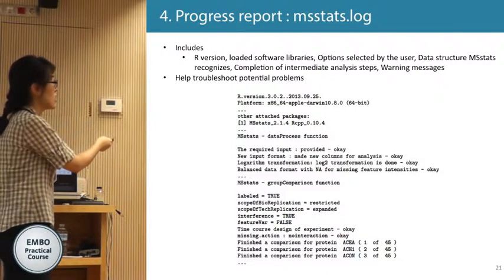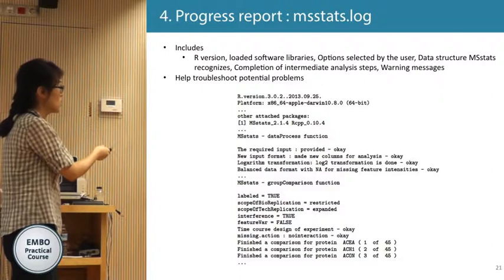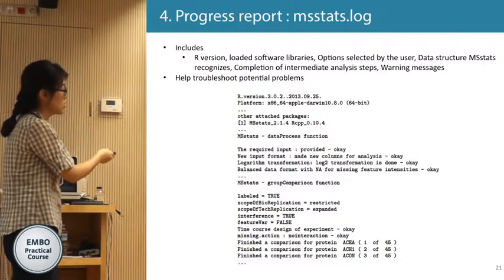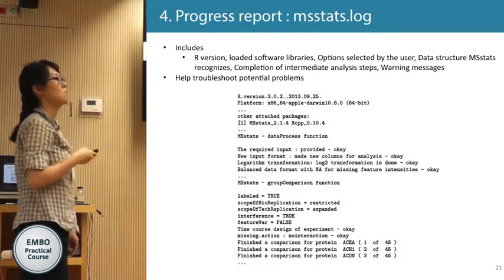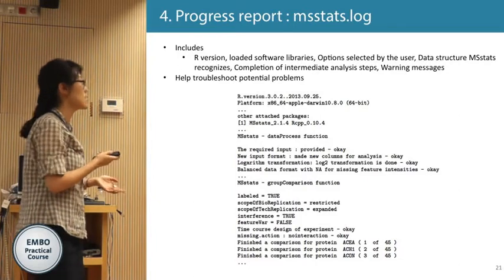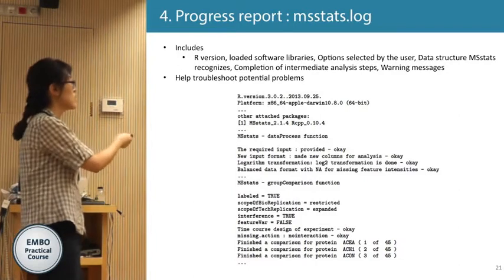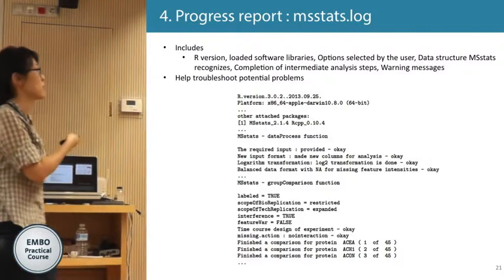So you can check you have the option you want, and it also shows the process. If you have some issues with installation, or you think something is not correct and you want to advise us, this log file will help to find where the problem came from.